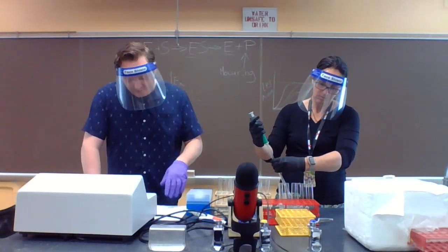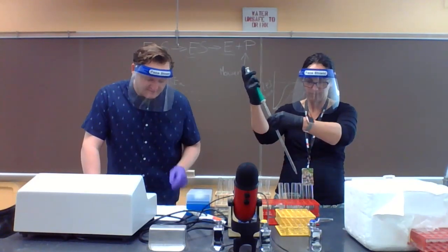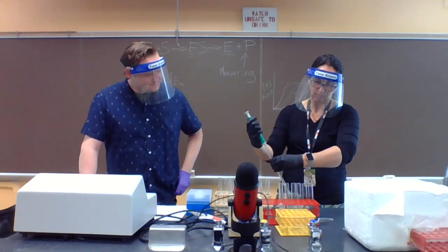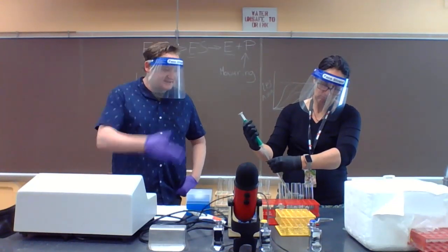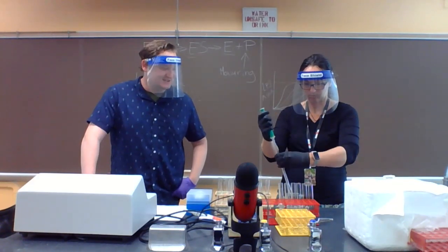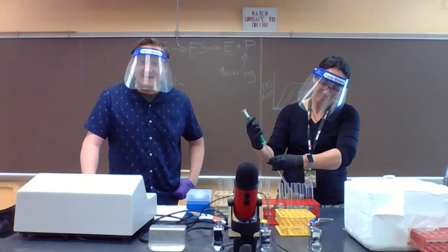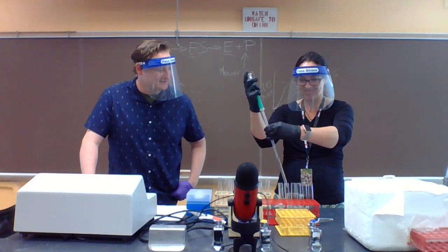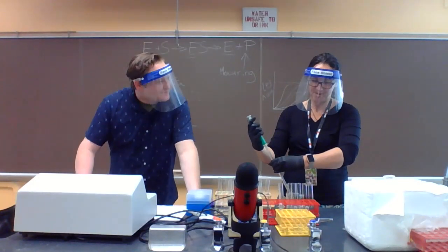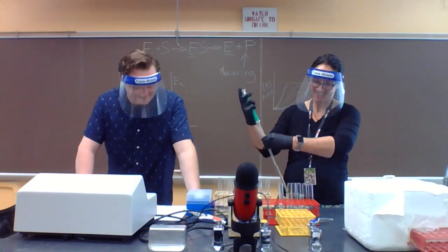So right now, Bridget is adding distilled water to all of our tubes in the volumes shown in column 1 of your table in the protocol, using a nice little pipetter. Fun device, it uses suction to draw the fluid up. It's much better than the way they used to do it, which was mouth pipetting, where they just literally put their lips on one of those things. No mouth pipetting in the 105 lab. Even if you were here, we wouldn't make you do that.